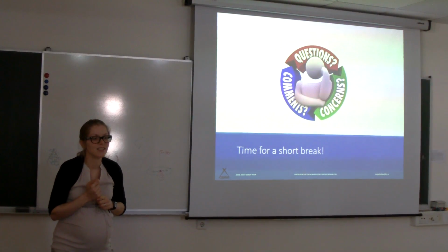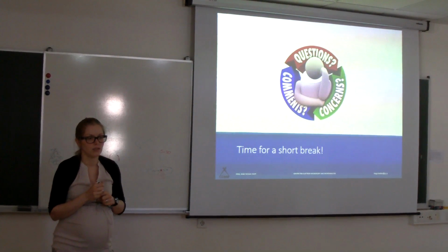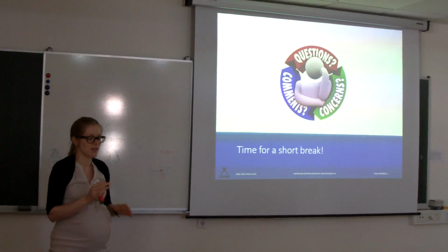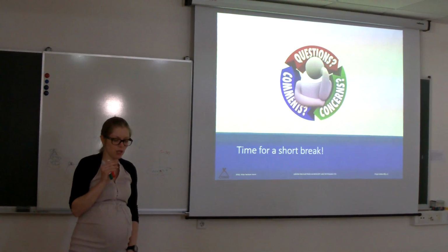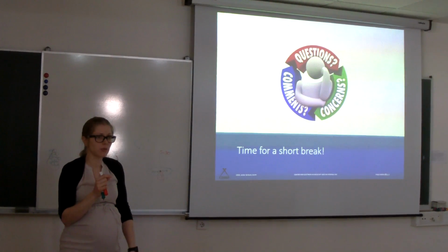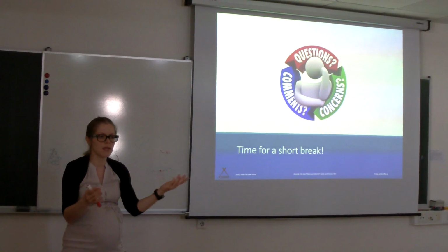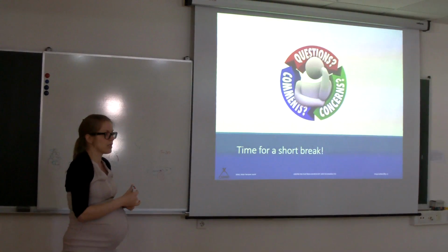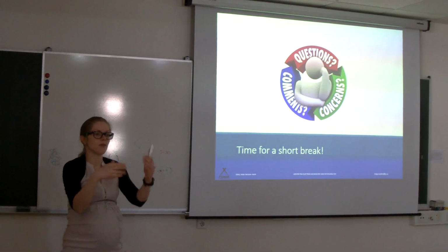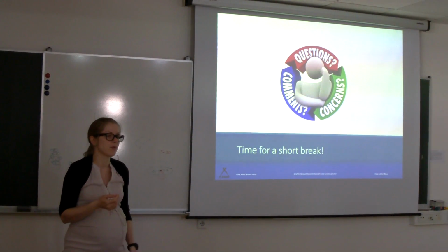About the Monte Carlo, what type of information can we obtain from it? I performed some simulations in which I could see the penetration depth depending on the Z value. What other information can we obtain? You can take anything. Monte Carlo just means a method where you put in random numbers and set how many iterations it will do. If you have thin layers or nanoparticles, you can simulate, if I have a thin layer of that and a thin layer of that, how many X-rays will I get from that? How will the absorption factor interfere? If you have a non-homogeneous sample, how would that affect it?